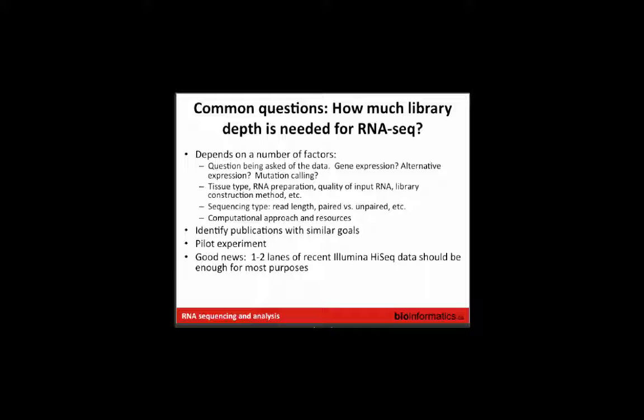So I thought that it's acceptable to use 40 million reads. When you say one sample per lane, it sounds huge. Yeah, so this 40 million figure, we referenced this paper somewhere as well in the online wiki. They evaluated that analysis only with respect to one application, gene expression. It's good for gene expression, yeah.